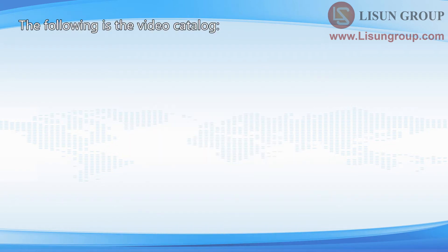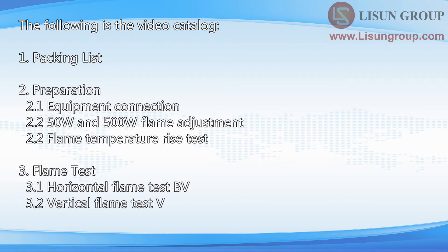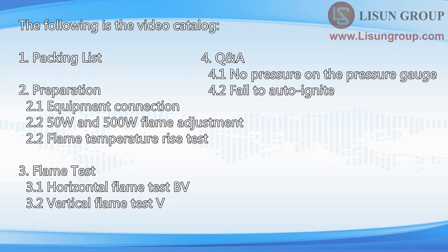The following is the video catalog: 1. Packing List, 2. Preparation, 3. Flame Test, 4. Q&A.